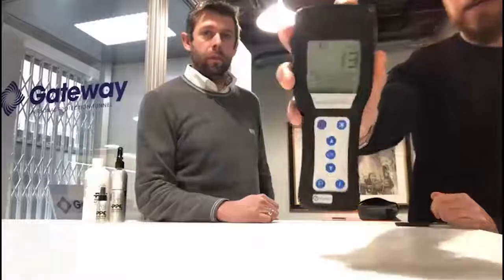So if you remember, we had initially an instant 67% reduction. So now we expect this to drop more from what it was. See, and now it's come up with 13. So the reduction that you're looking at now, without doing all the maths, is probably more like 80–90%. And if we were to do this again in another hour, you'll probably find that it's a complete reduction.